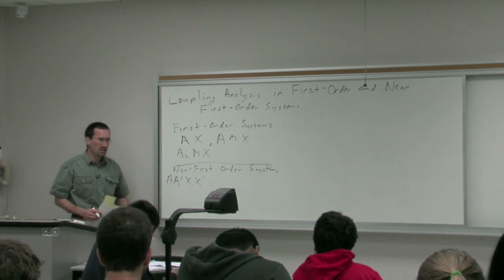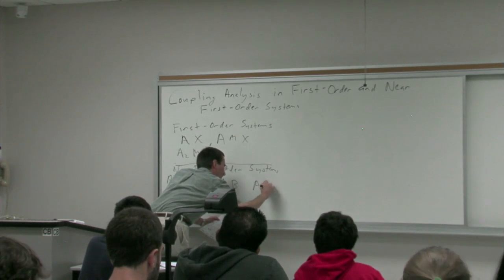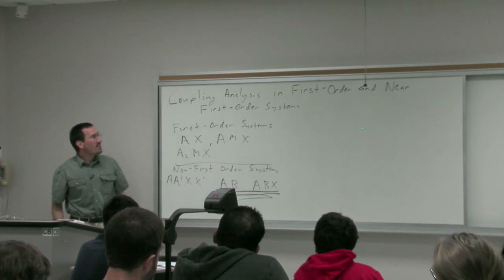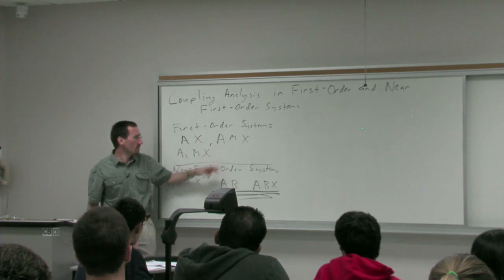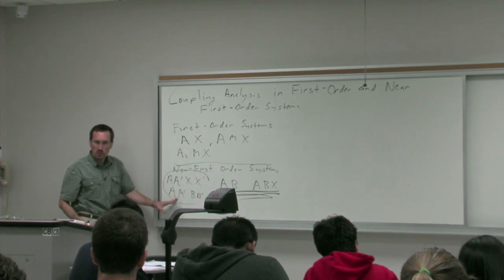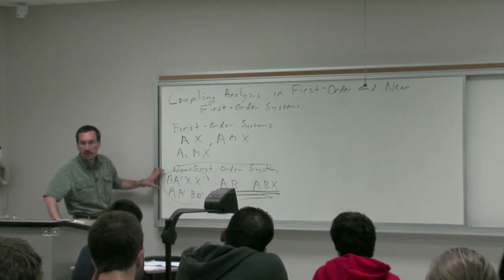And then I said we have other systems like AB systems, where the protons are similar in chemical shift, and ones that are related to this, for example, ABX systems. The good news about many of these non-first order systems is that they behave very much like first order, and you can apply some type of simple rational understanding to them, which is more than I can say for an AA prime, XX prime system, or an AA prime BB prime system. Sometimes these systems will look like first order, which is great, and many times you can analyze them as first order. But what I tried to show you last time was how there are ones that simply defy a simple reduction.